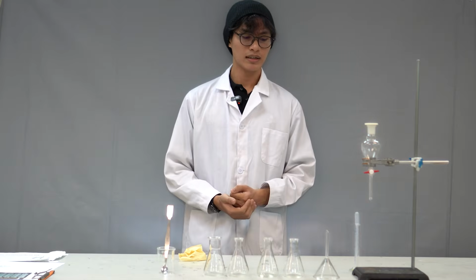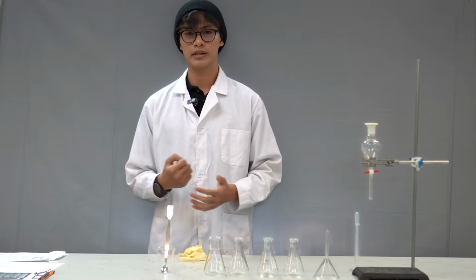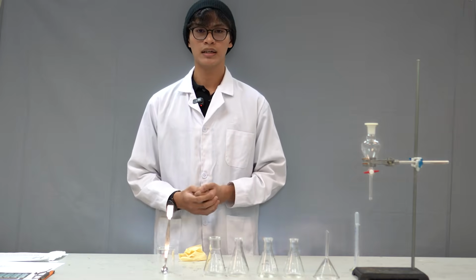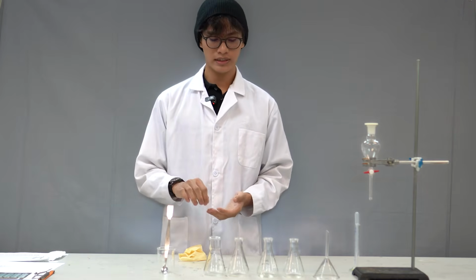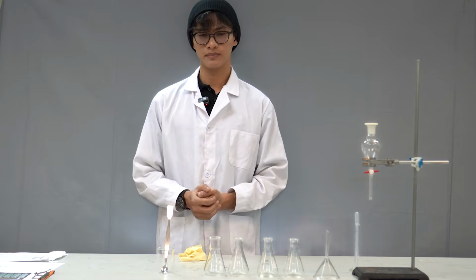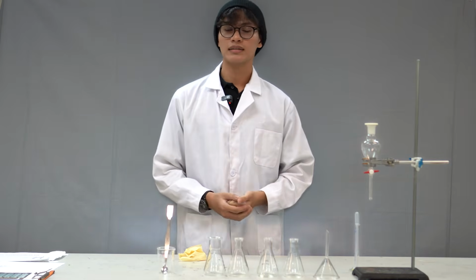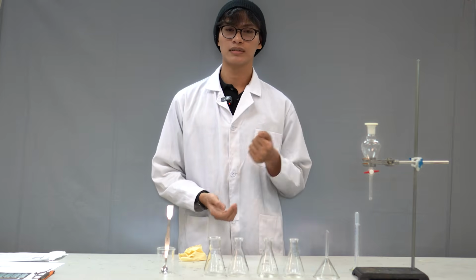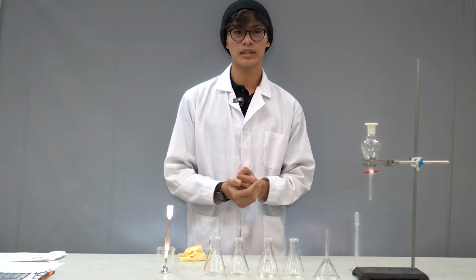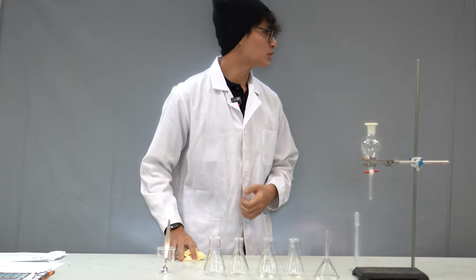So, as a precaution, within the area of the experiment, any potential heat source must be removed. Other than that, since a strong base and a strong acid were used in the experiment, we were extra careful when pouring the reagents to avoid splashing and contact with our skin or eyes. And lastly, all work involving volatile organic components and concentrated reagents was performed in a well-ventilated fume hood, which is located at the back of the laboratory. So that will be all from me. I'll pass the presentation to Brother Amer.